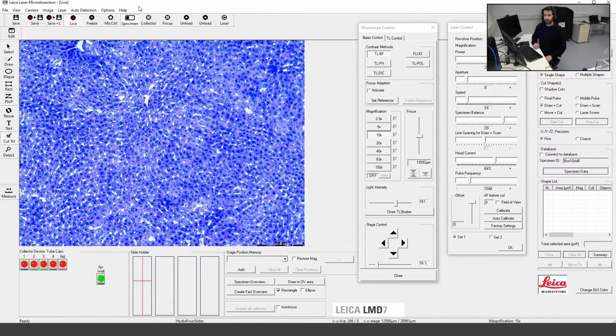From the basic introduction of laser microdissection, we now come back to the real workflow I wanted to show you. And remember, I wanted to show you how to cut some reference points, image this sample with the reference points, take this image information to Aivia, where we then afterwards identify our regions of interest with AI, and then coming back with these regions of interest to the LMD itself.